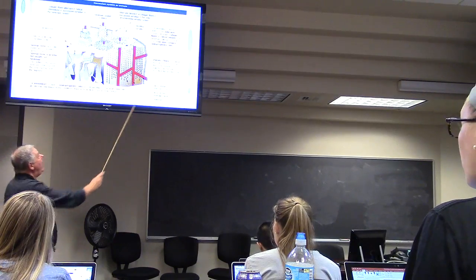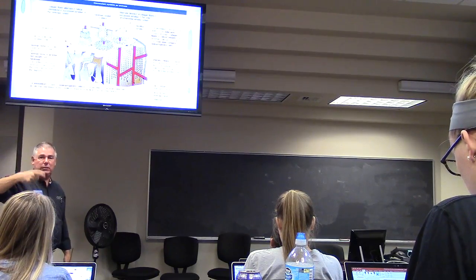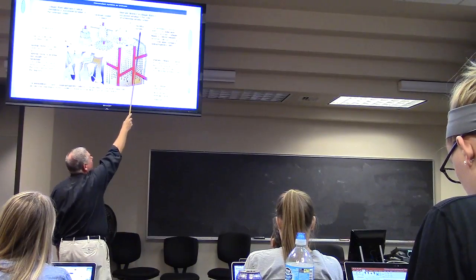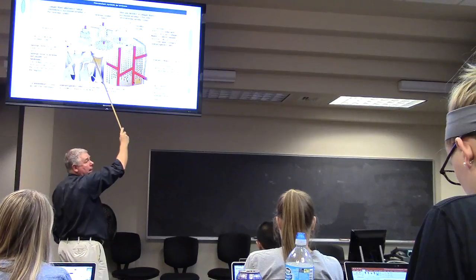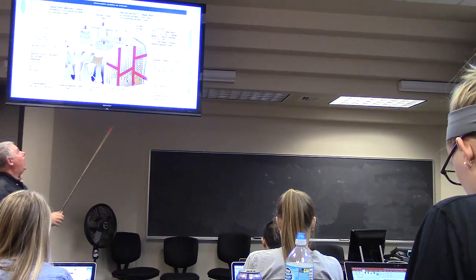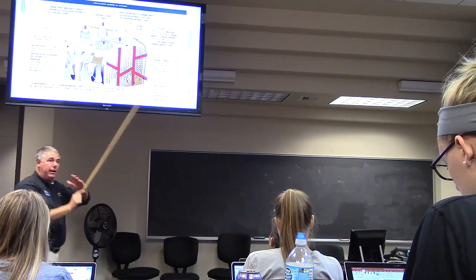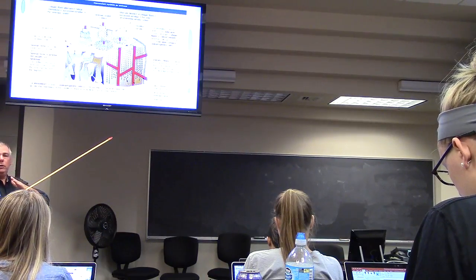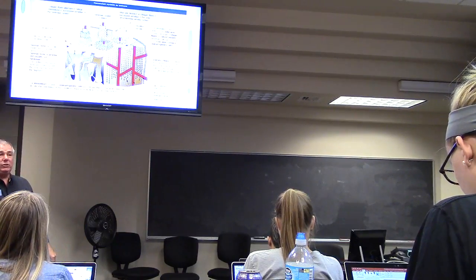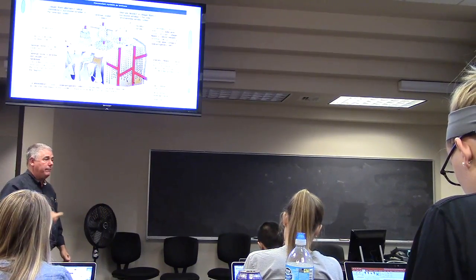Also, if you look on the outer edge and on the inner edge, you don't have the Haversian systems. You have concentric rings here called lamellae. You've got an external and an internal lamellae of osteocytes. And the collagen that's laid down in these lamellae is 90 degrees to each other. So this really adds a lot of strength to the bone. So when we go back to the first slide and the whole talk about increasing the width and strength of bone, this is why.